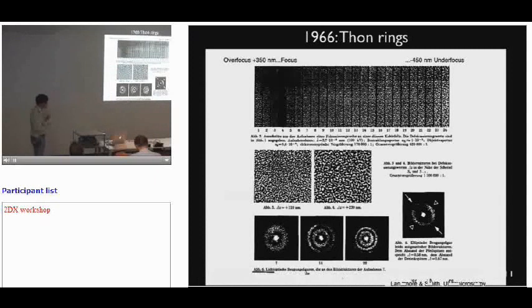Yeah, so this was one of the first publications on this, about the basic birth of the term, the Thon rings that we now work with all day. According to the phase contrast theory, they could see at that time that once they focused their beam on the carbon grain, it would change dramatically. They converted the micrographs to optical diffraction patterns, and then they could see that the carbon grain gives rise to distinct Thon rings that depend on the defocus. As we move stronger into underfocus, we see more and more rings appearing, and this was the very first description of this, I believe.